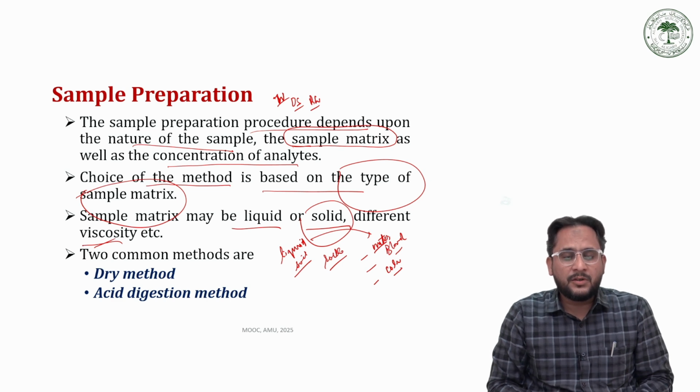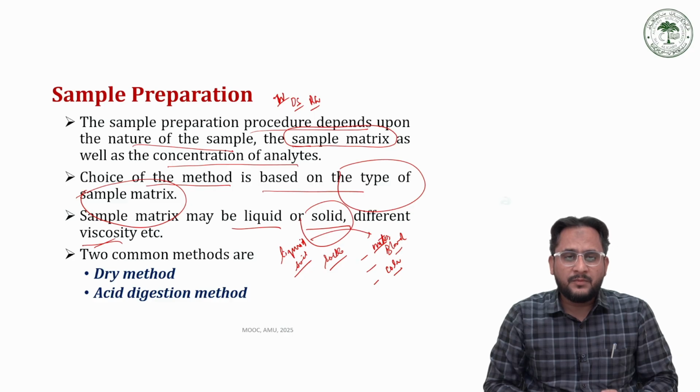So those impurities cause clogging of the pores of the tubes of nebulizers. Therefore, we always filter the sample, even if it is a clear solution, so as to avoid all the chances of clogging of the tubes of nebulizers, to keep all the components working efficiently.